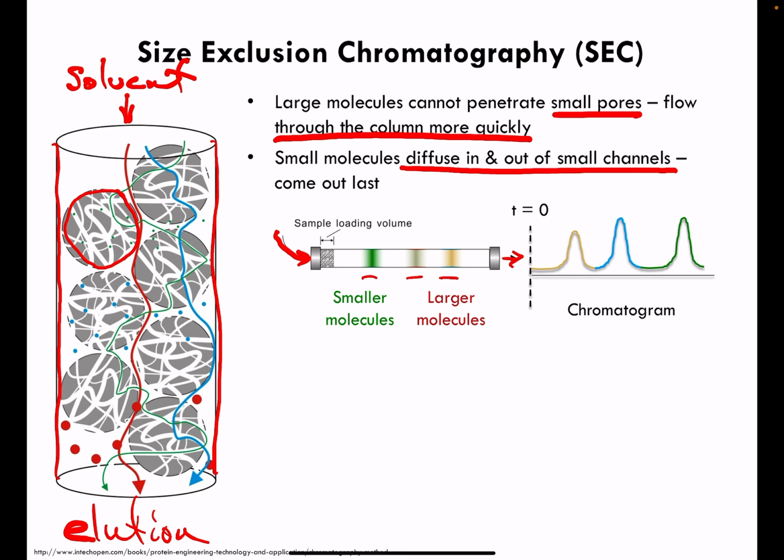And ultimately, some sort of detector here would be able to register the presence of molecules by way of either a viscosity change momentarily in what was coming out of the pipe, perhaps a refractive index change, given the refractive index difference between molecules and the solvent used. Lots of ways to detect elution products through this pipe.